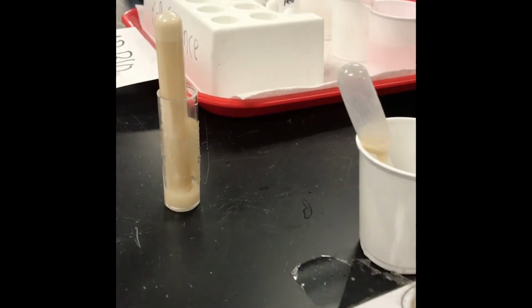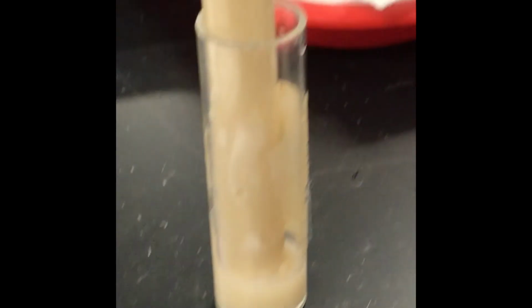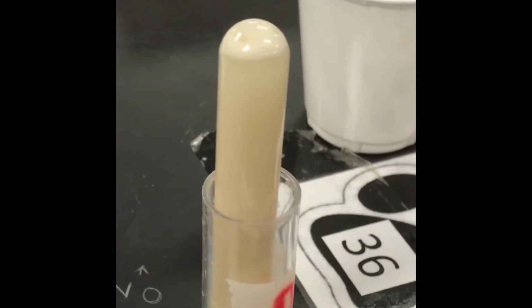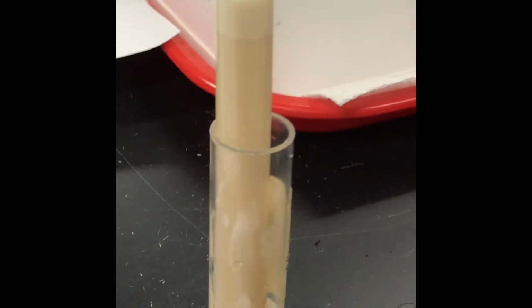Okay, so they just did a 6-minute measurement. Look at this foam. Not only is it at the top, but you can see it's starting to push some liquid out of the bottom. Okay, then the next tube is right here. This is looking really good. This is tube D.